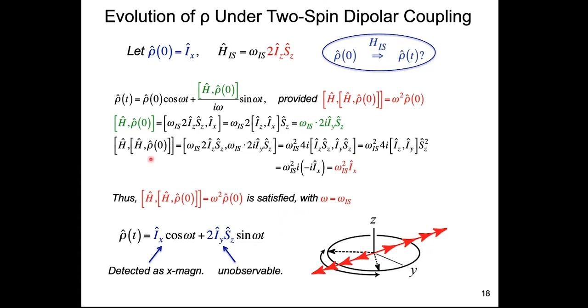Okay, so doing this work allows us to go back to this solution to the von Neumann equation and say, okay, I've got Ix here, cosine omega t, and then I need to plug in the result of my calculation, Iysz, that's here. And then you see that all these coefficients basically work out to divide out any imaginary. You have nothing in the end that's imaginary. Everything you detect is real, and you don't have a frequency or omega either. You should have all of these spatial terms in a cosine sine. So this is what you should expect to see.